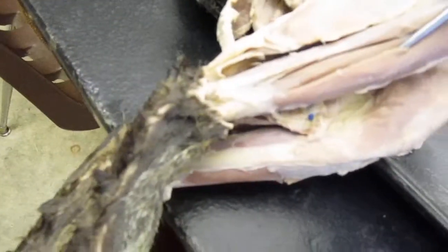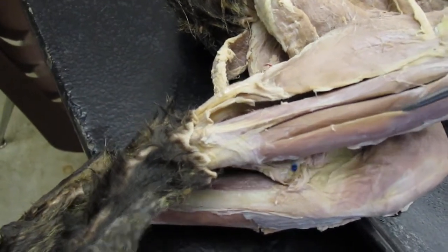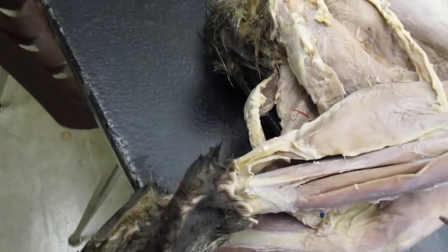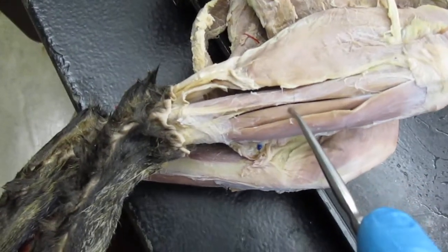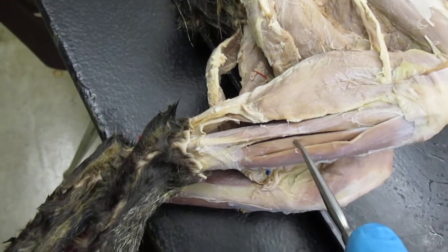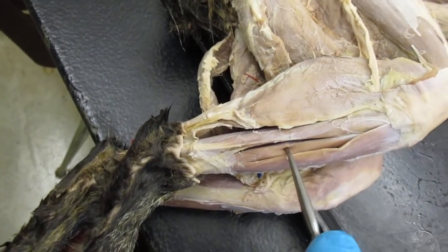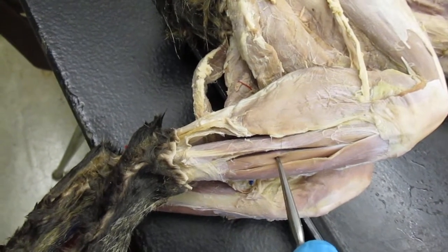So this one right here is your tibialis anterior. This one right here, right next to it, is the extensor digitorum longus. Extensor digitorum longus on the lateral side.